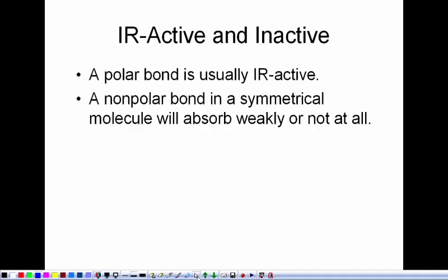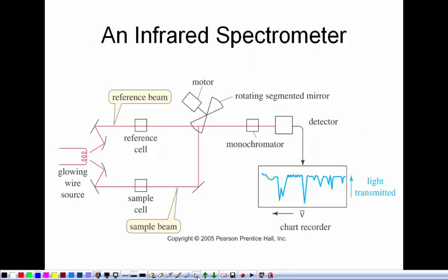The way we make this measurement is using what's called an infrared spectrometer. Basically, we need a source of infrared radiation. That turns out to be a glowing wire. If you've ever seen an infrared heating lamp that's used, I don't know, to keep reptiles hot, might be a place where you would see it. Sometimes in hotels, they'll put an infrared lamp above the shower so that when you step out of the shower, you feel this warmth, which is the infrared light coming down. At the fast food places, they'll use infrared lamps to keep the food hot. So you just need an infrared source.